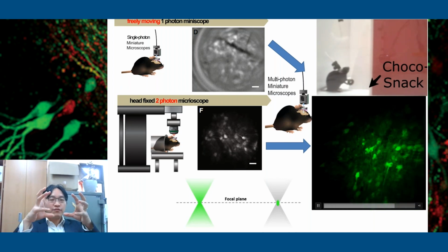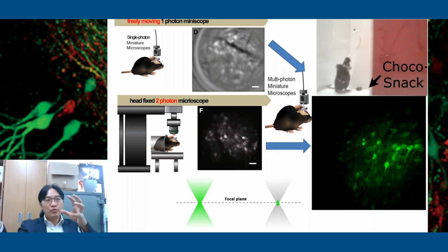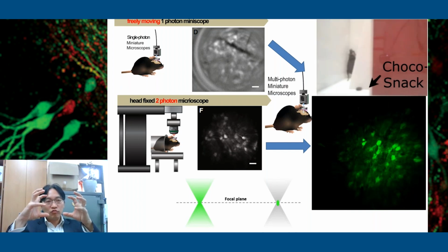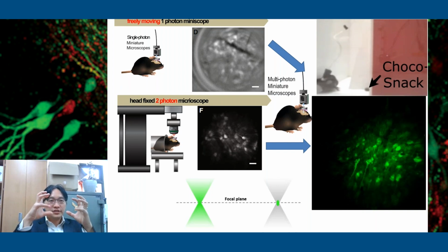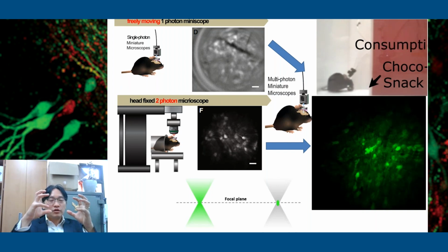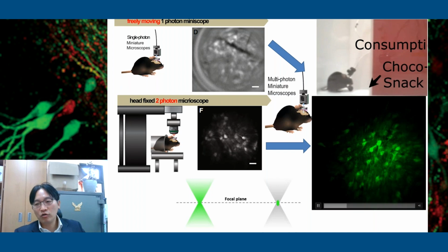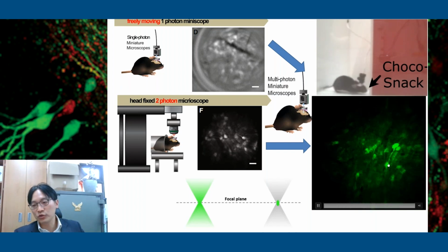And after doing calcium imaging for several days or weeks, when we sacrifice the animal, we get this cubic brain sample, and then we do 3D imaging of this same cubic sample, and we do molecular functional identity imaging using FISH or other techniques, and then we can really tell, oh, this neuron has a receptor, this neuron has a leptin receptor, this neuron is a dopamine neuron, and this neuron is a double positive neuron.